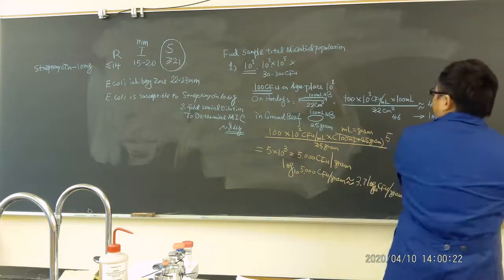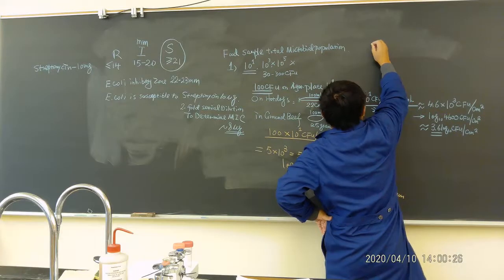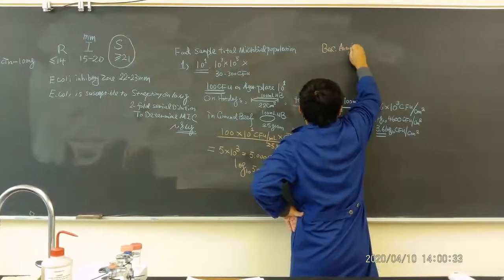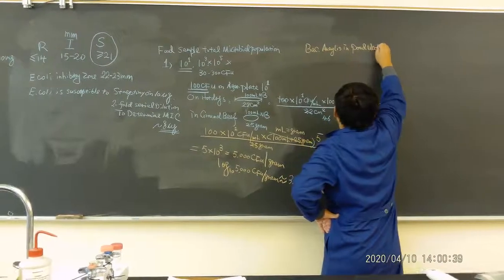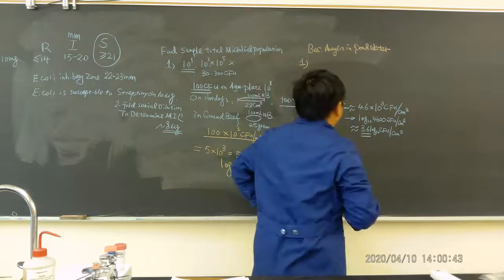Okay, this is what we finished talking about last week. Today's work will be very easy, but it's important. We will do bacteria analysis on a sample we get from the pond water. So we get a pond of water, do a water sample.